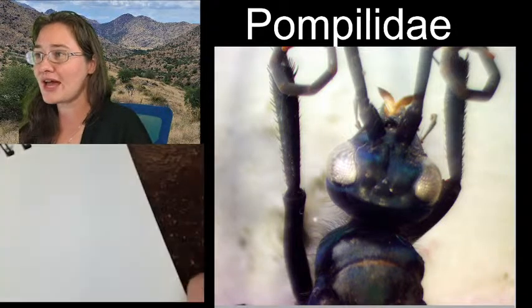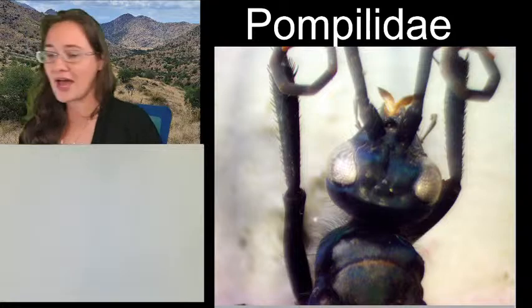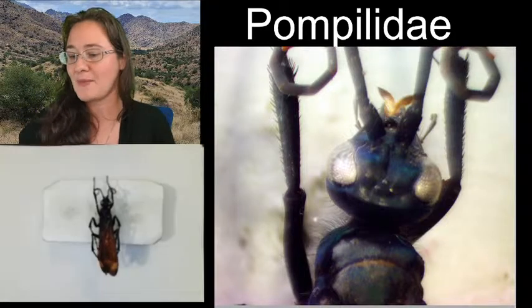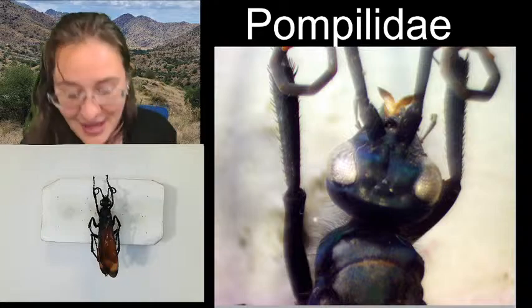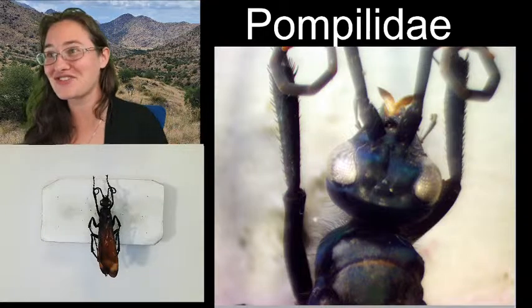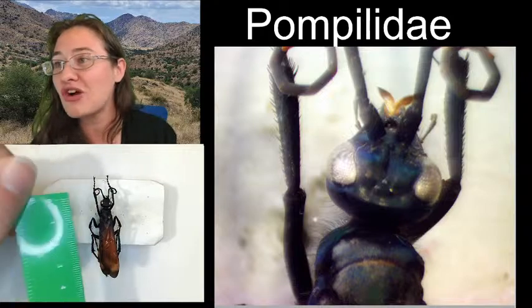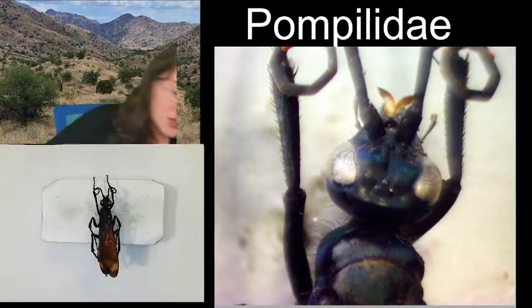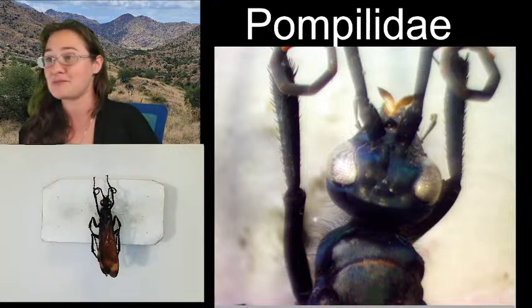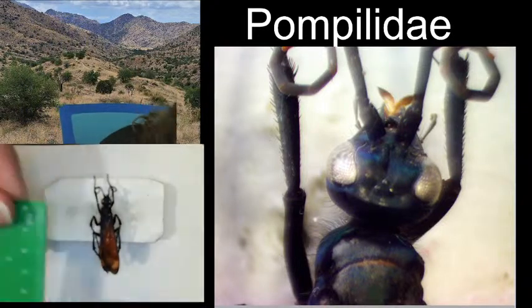I'm going to go ahead and get this stuff set up. I'm going to bring her back over here just for a minute because you need to know how big she is. And she is not fitting underneath the microscope in one image. I'm not going to go from the front of her antenna. I'm going to go from the front of her head to the back of the abdomen. So her abdomen does end a little bit shorter than her wings.